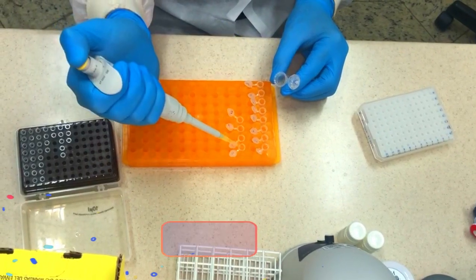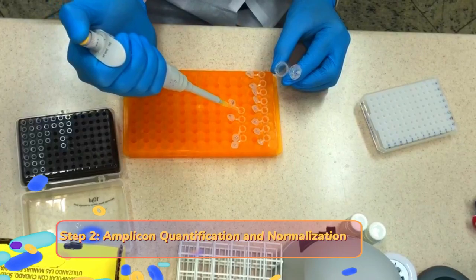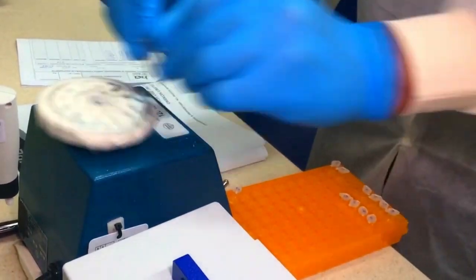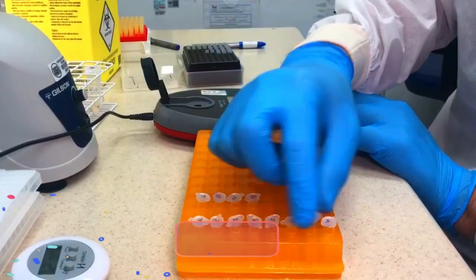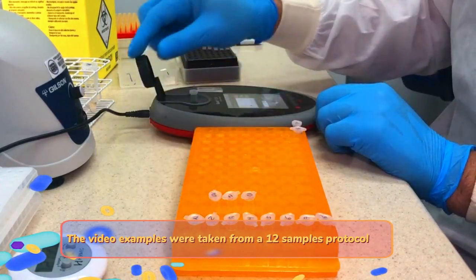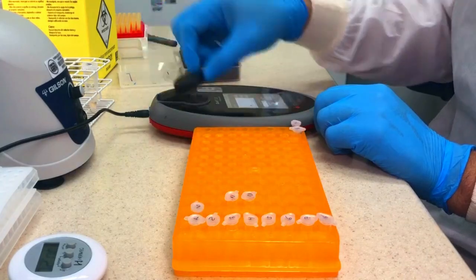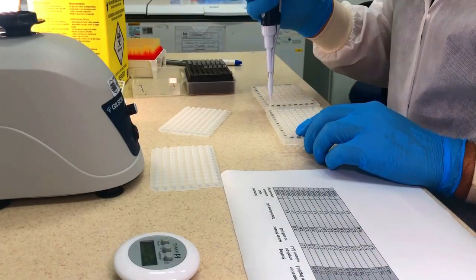After amplification is finished, you need to quantify your DNA. This is done using a Qubit or a Quantus device, but it is essential that you quantify the amplicon using a fluorescent method. Prepare your reaction according to the vendor's instructions. The result will be used to dilute the amplicon to a concentration of 200 nanograms.